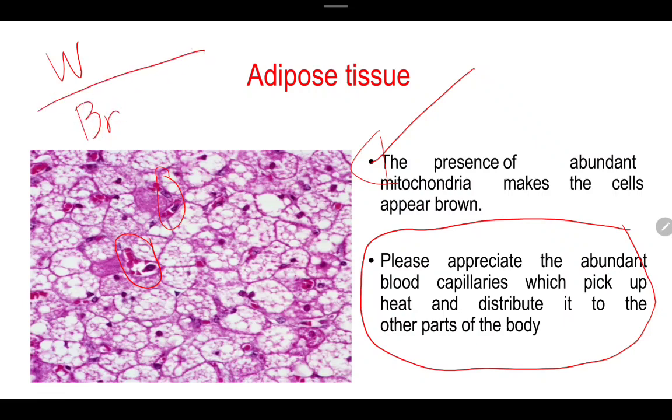Palatandaan ko dati when I was in college is that ginabase ko siya sa mga tao. So, si white, for white Americans, diba? They are big. And then, ang big doon is the big lipid droplets. Whereas the brown, tayo, mga Pinoy, diba? We are okay. So, they are unilocular, ang white. They are multilocular, ang ating brown.